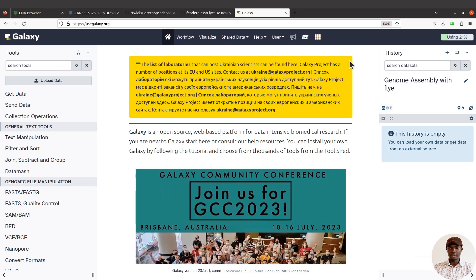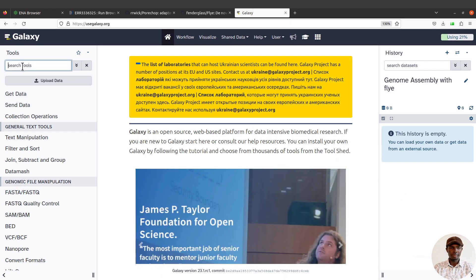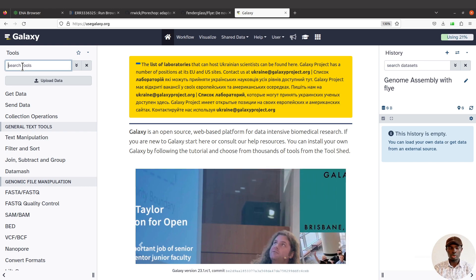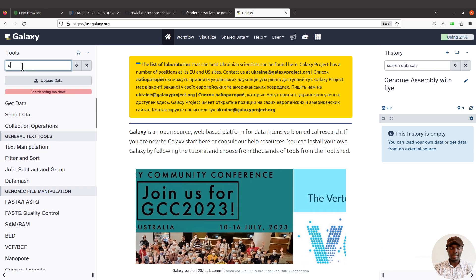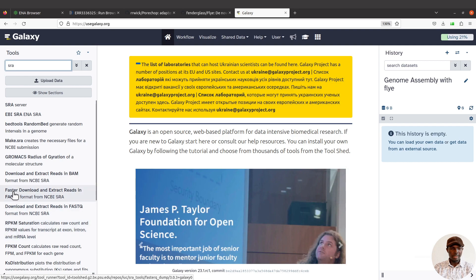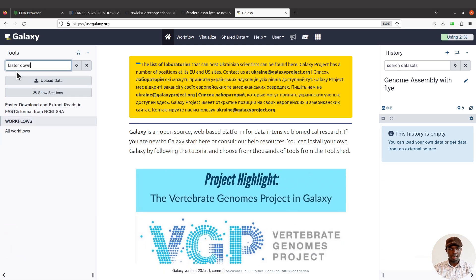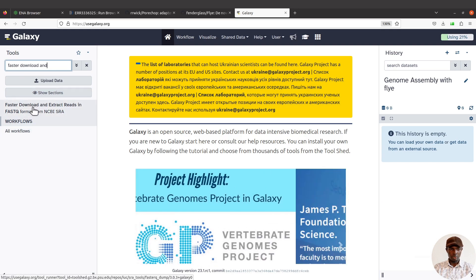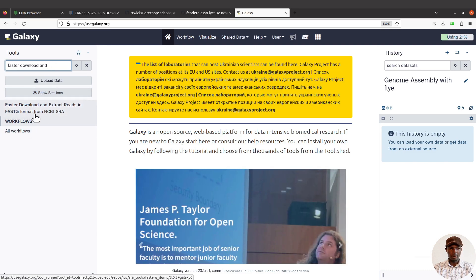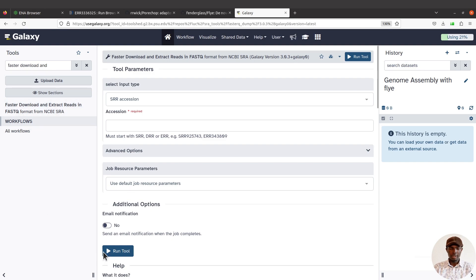Now I'm going to import the data. Come to the search tools section on this side and click it to search. I'll show you two approaches: you can type 'SRI' and a list of tools will come up, and we will use 'Faster Download and Extract with SRA-Tools'. You can also type the full name. Either way, make sure you have this tool listed and click it.